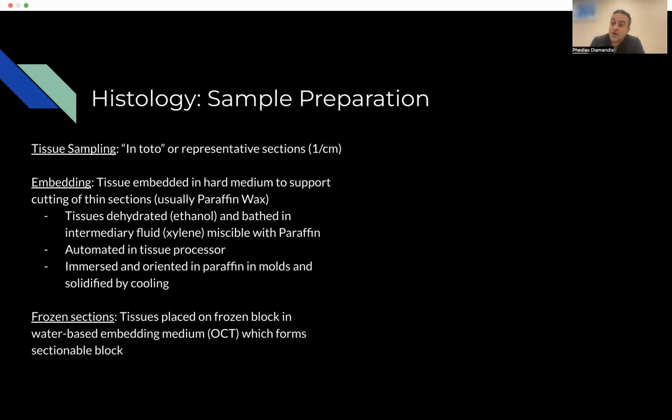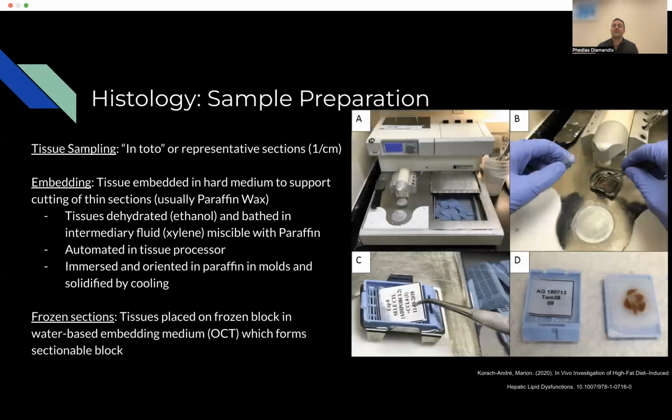So they're really good for intraoperative examinations, but come with the downside that the morphology, the quality at the end, is not as good, and obviously you cannot store them as easily as you could with wax. You would need to store them in a refrigerator or a freezer, which is much more expensive than, let's say, a cupboard for paraffin embedded sections.